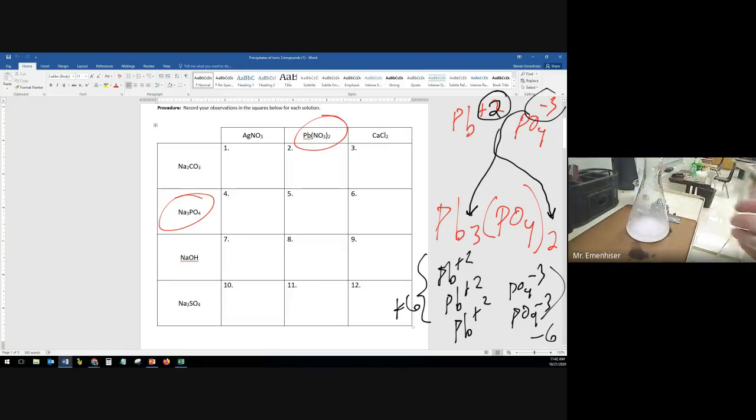So let's get some water in here so that I can gather all of this solid that settled out. Num num. And let's see if we can filter it. And hopefully by the end of the video, we'll see some results. Let's actually get some more water in here. So I'm going to spray it, holding it like so, and make sure I try to get all that solid. Yummy, yummy.